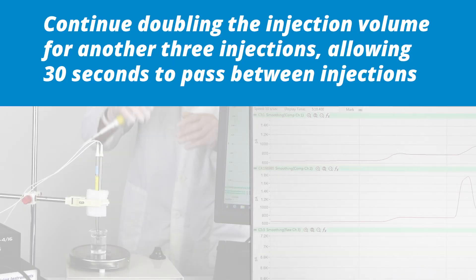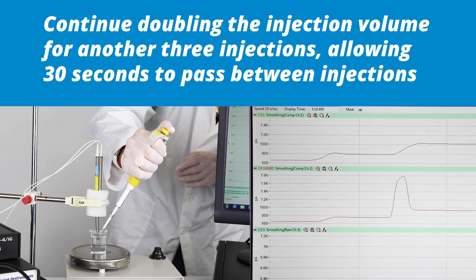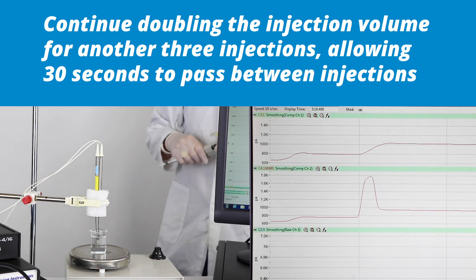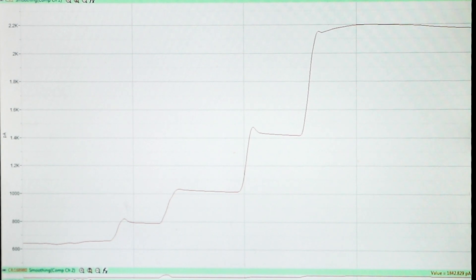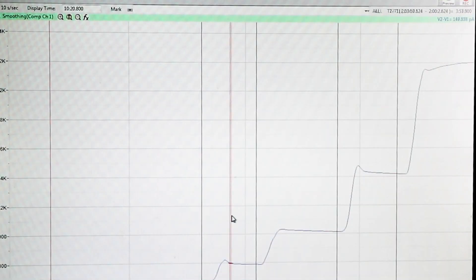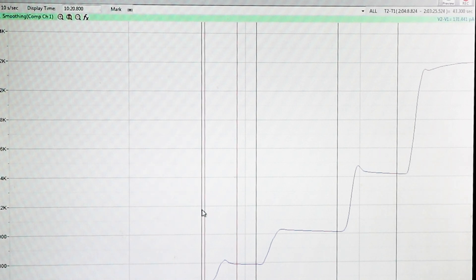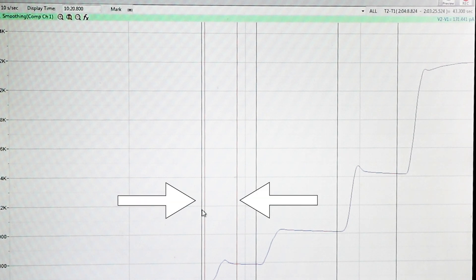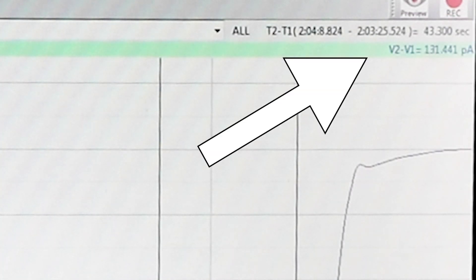Continue doubling the injection volume for another three injections, allowing 30 seconds to pass between injections. When you have finished, you should have a data trace with five distinct plateaus. Using the LabTrack software, determine the distance between the baseline reading and the plateau reading for each aliquot — that is the distance between our two red cursor lines. The delta is shown in the upper right corner on the screen.